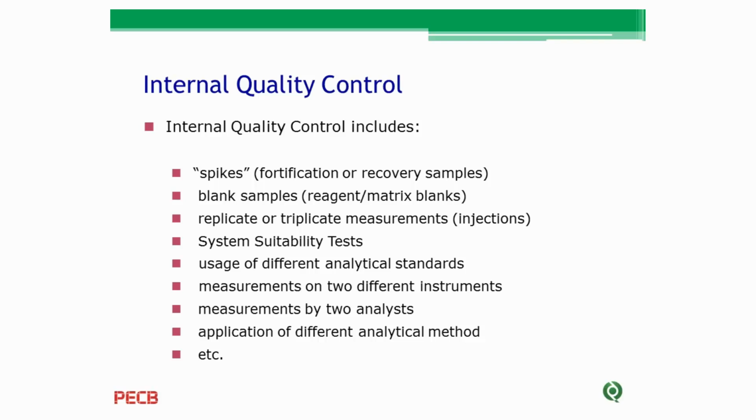Sometimes we analyze blank samples. When we talk about blank samples, we mean in chemistry, samples in which the analyte is not present. We want to check if there is any pollution in our reagents or equipment or measurement system totally.